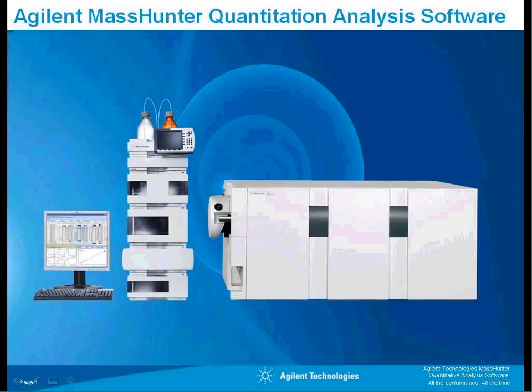Let's talk about the signal-to-noise calculation. We offer a feature which automatically calculates the signal-to-noise, and I would like to spend some time explaining how that algorithm works. The algorithm cannot accomplish the same decisions as a trained analytical chemist, and that really boils down to picking the noise regions for the signal-to-noise calculations.